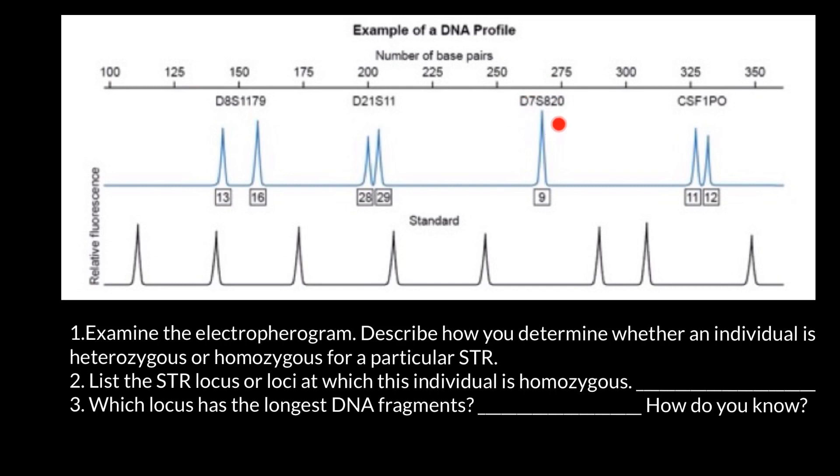But at the locus D7S820, we see one large spike. This gives me information that this person is homozygous for this locus. Some of you may think, why am I so sure? Maybe just the second chromosome at this particular place or locus has a mutation, and we just lost the second spike here due to mutation at the site where primers have to attach.